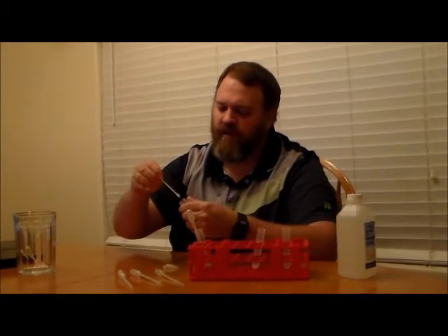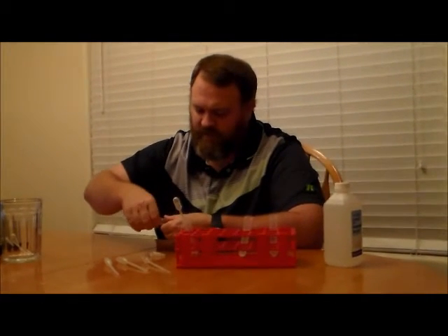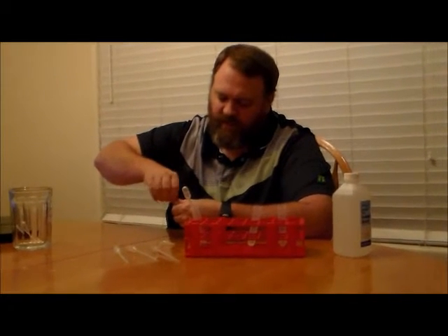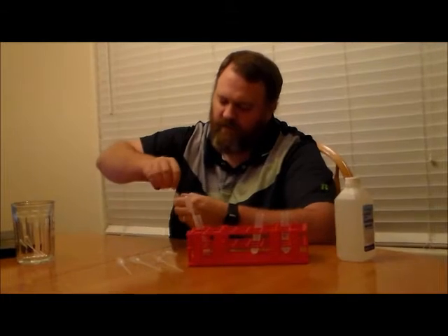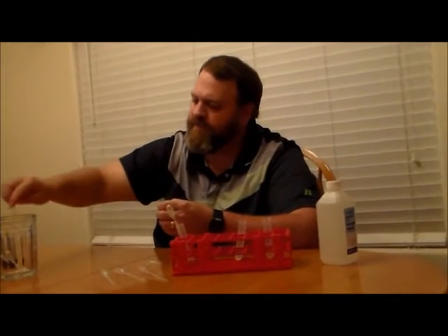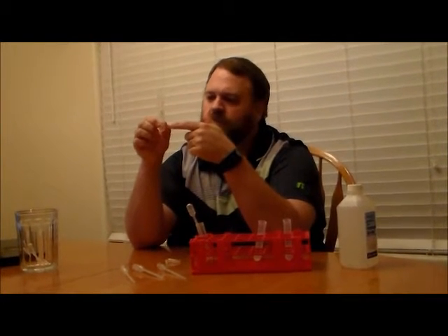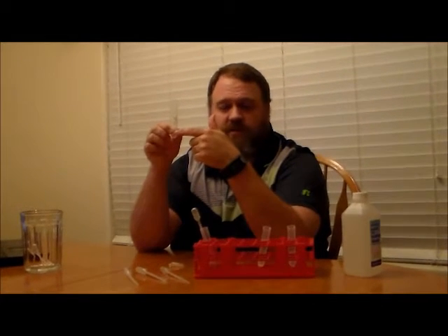These buccal swabs are actually how we collect DNA from suspects who have to provide a DNA sample — we do a swab on the inside lining of the cheek. It's called a buccal swab, B-U-C-C-A-L. I'm going to dip this last swab into the test tube labeled 'cells' and squeeze the excess liquid off the edge. So now I've deposited cells from the inside of my cheek into this liquid — a mixture of water and soap.